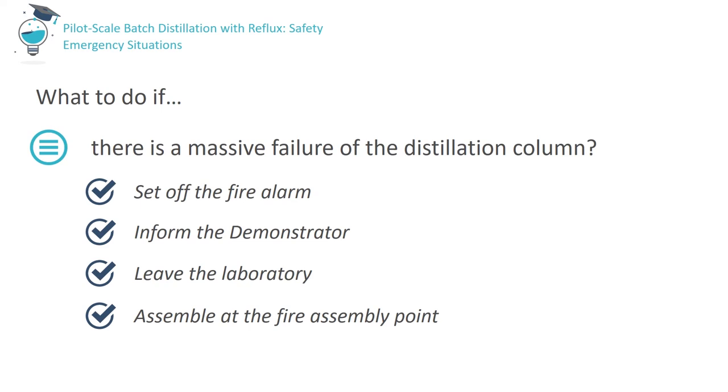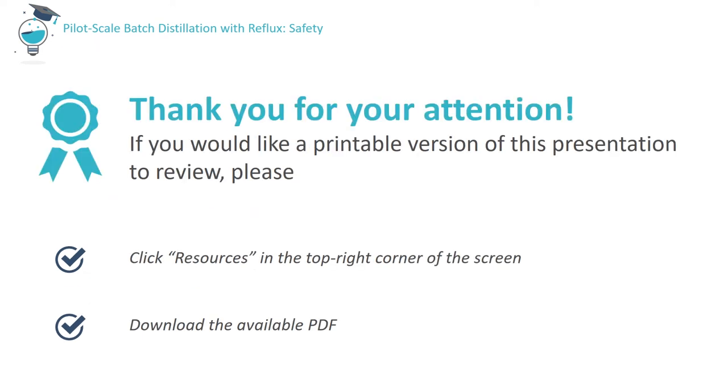If there is a sudden, large escape of vapour or liquid from the distillation column, set off the fire alarm, inform the demonstrator or another member of staff, leave the room immediately, leave the engineering building and assemble at the fire assembly point. Thank you for your attention.